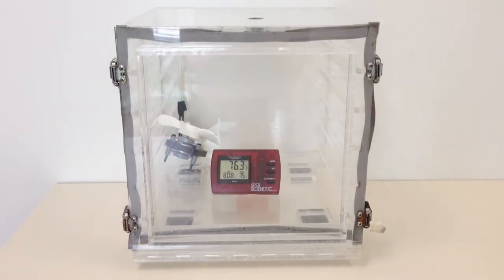Model 800-041R is useful whenever monitoring of humidity and temperature is critical, as in pharmaceutical and semiconductors, clean rooms, warehouses, museums, workplaces, environmental chambers, greenhouses, and ripening rooms.